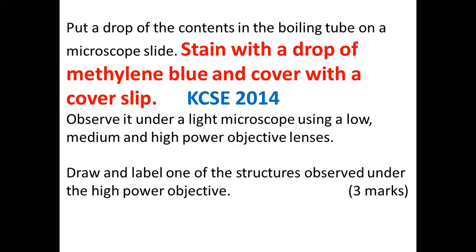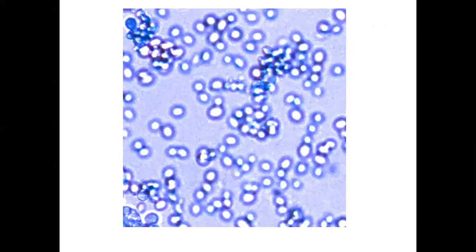And once you know that there are several types of slide you can make, you can now be keen on what to observe. And you can see, since this one, we have done it so many times, there's one trick that you need to know. Remember, this yeast cell have been respiring for some minutes, about 30 minutes. And when you're told to draw, don't just draw any cell, because some of these cells are already dead.